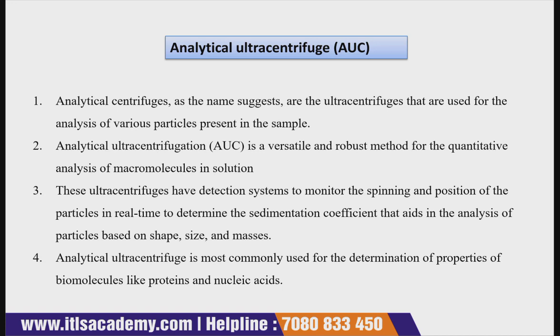The analytical centrifuge studies or analyzes the particles present in the sample.